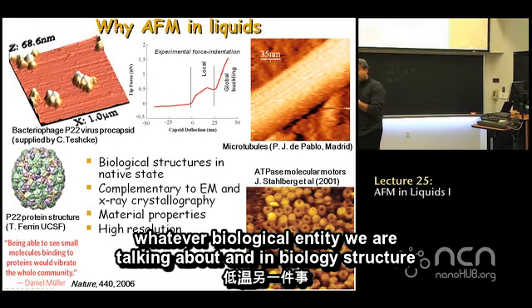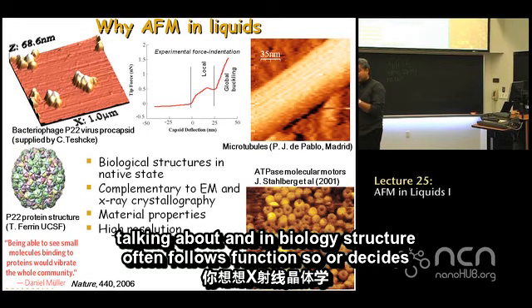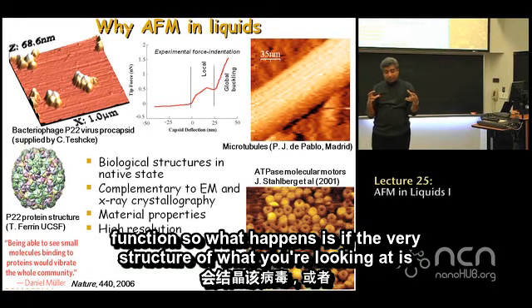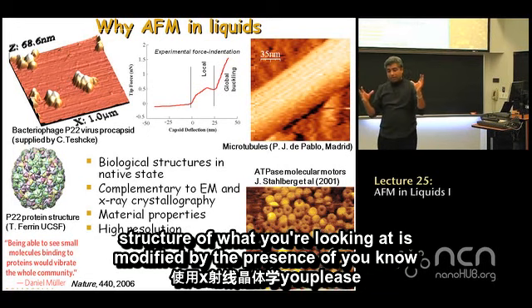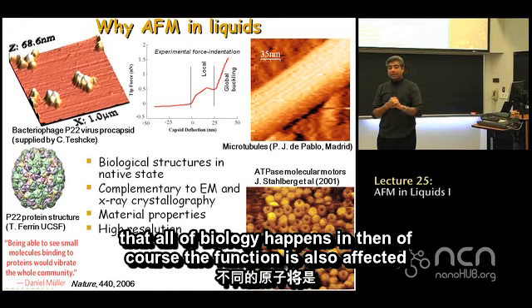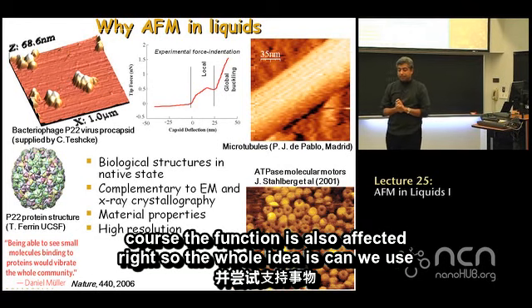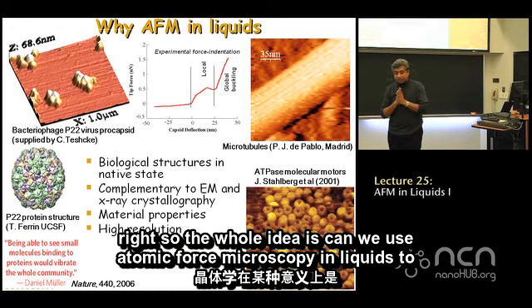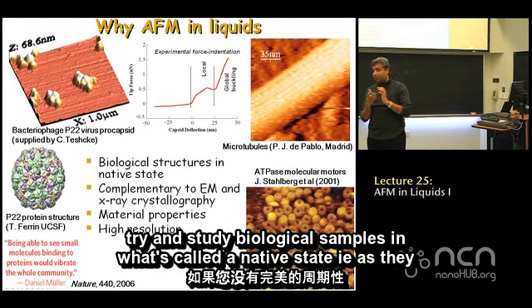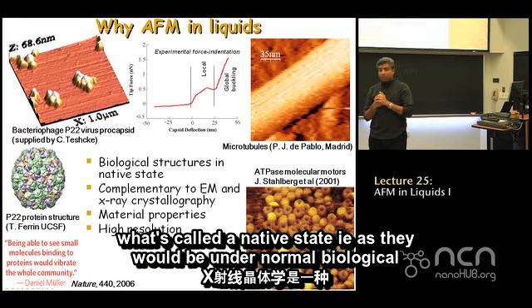And in biology, structure often follows function, or decides function. So what happens is, if the very structure of what you're looking at is modified by the presence of the saline water-based solution that all of biology happens in, then of course the function is also affected by it, right? So the whole idea is, can we use atomic force microscopy in liquids to try and study biological samples in what is called native state, i.e. as they would be under normal biological conditions.